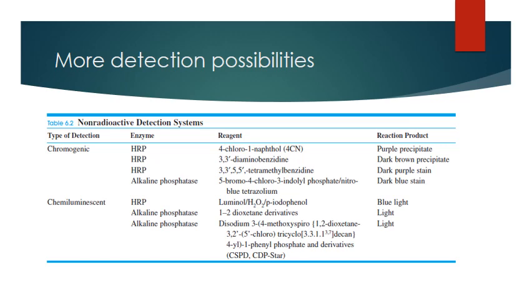In a chemiluminescent situation, you can use the same enzymes, but add a chemiluminescent reagent, and that'll emit light, which can be read by, again, a luminometer, and it can measure the intensity of the light.